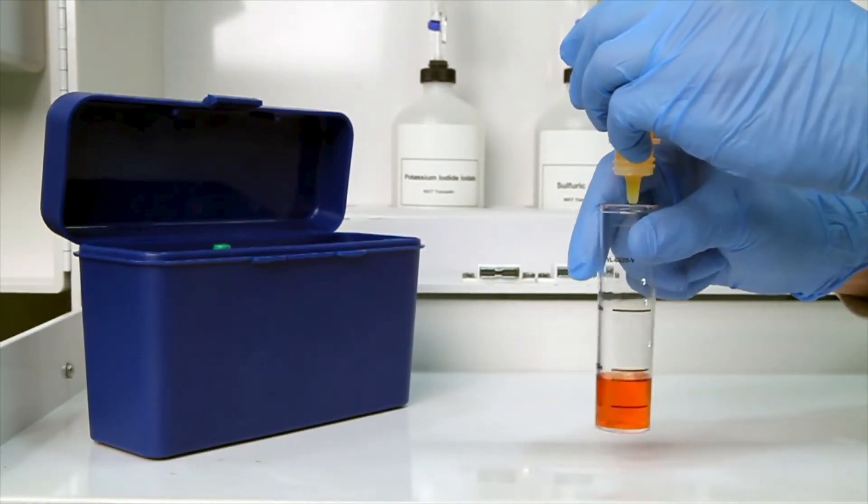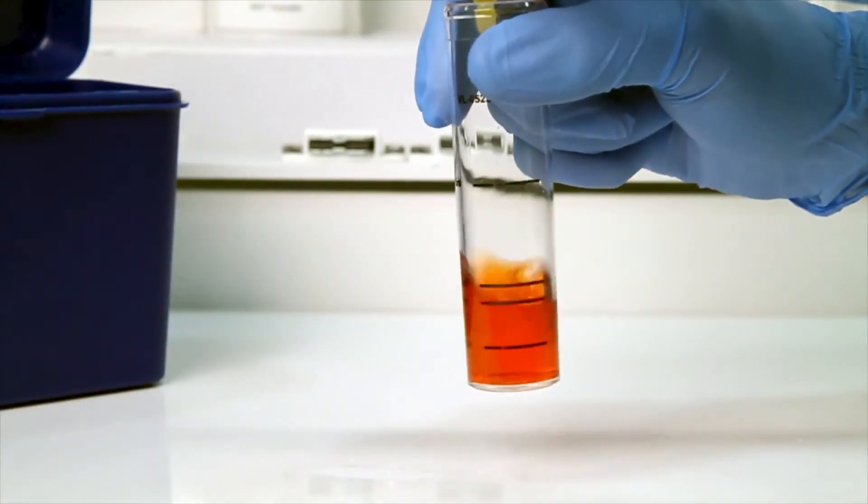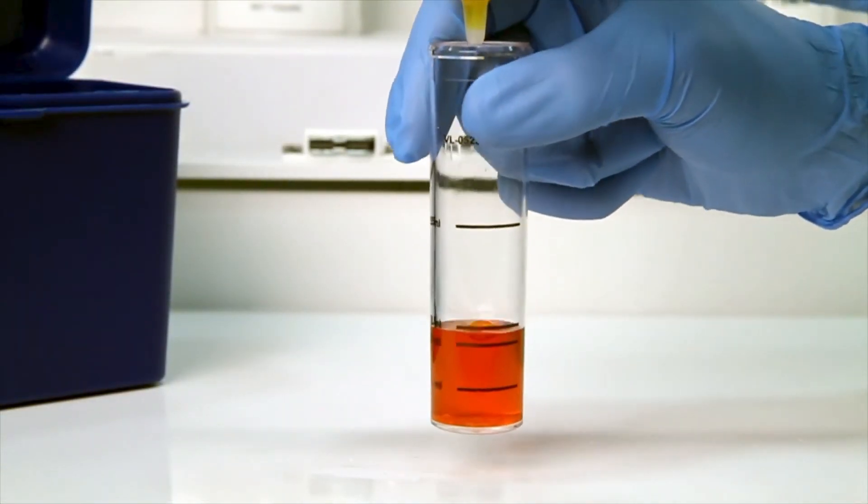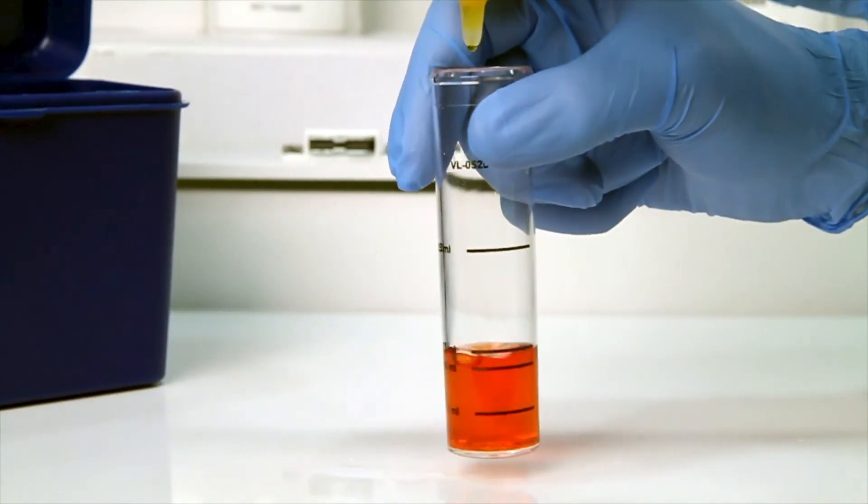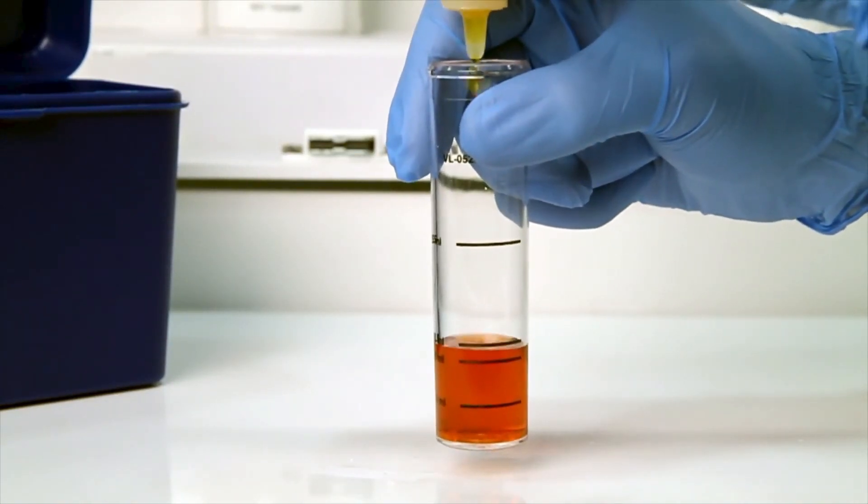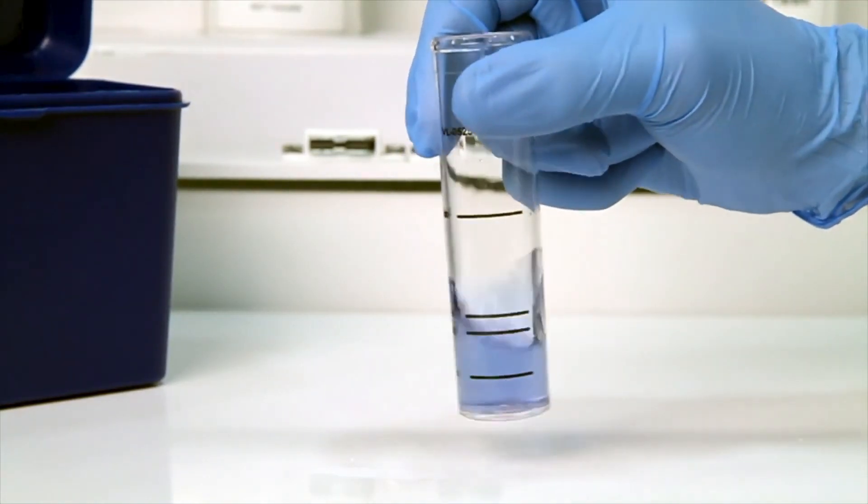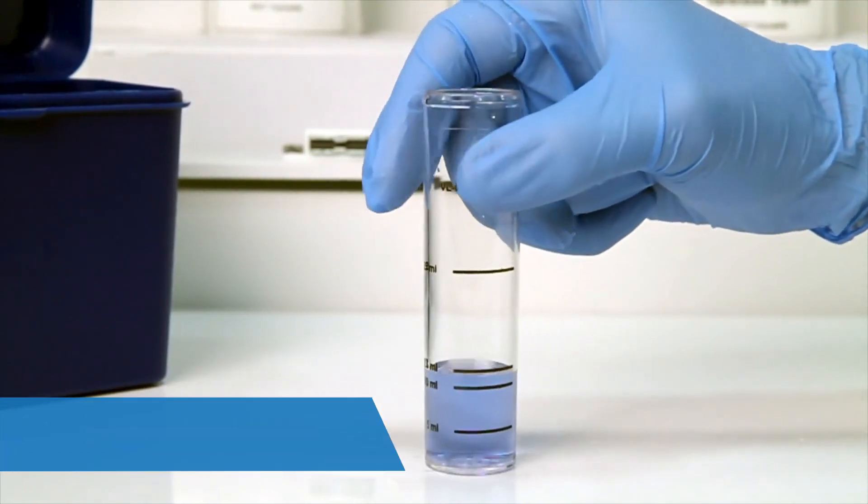The bottle contains a dropper tip, so it's important to hold the bottle vertically to get a consistent drop size. After the addition of each drop of titrant, you want to swirl the vial to make sure the sample is properly mixed. Count the number of drops during this step. The titration is complete when the sample changes from orange to blue.